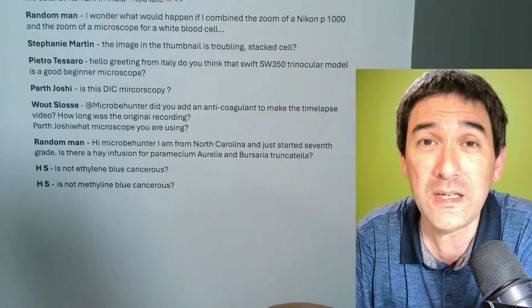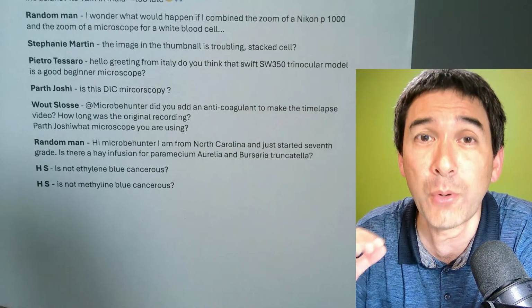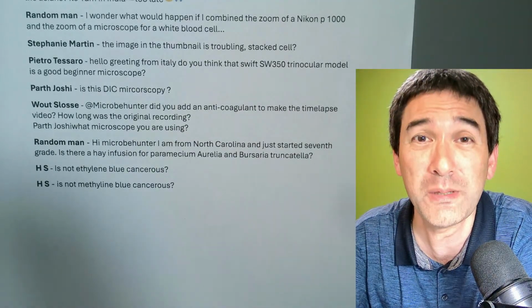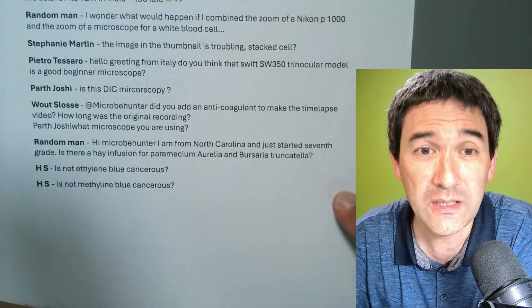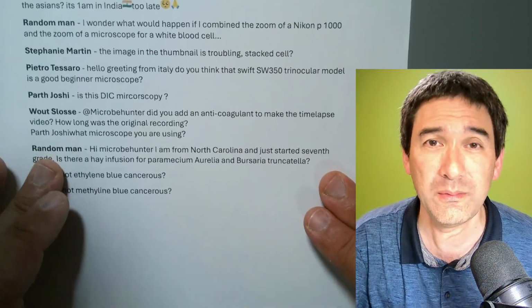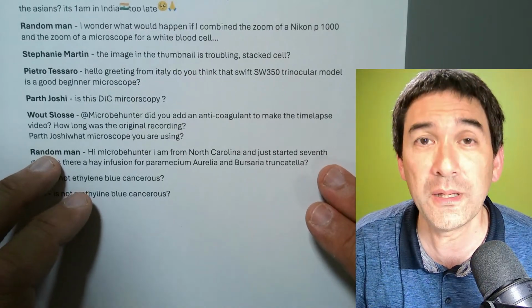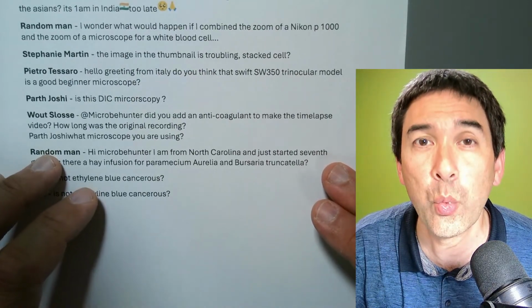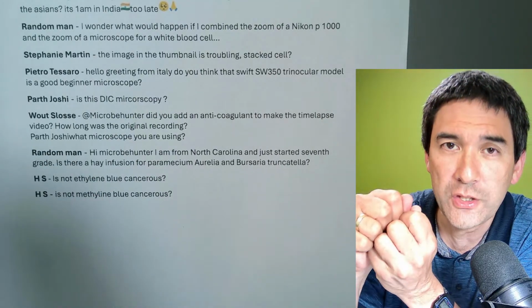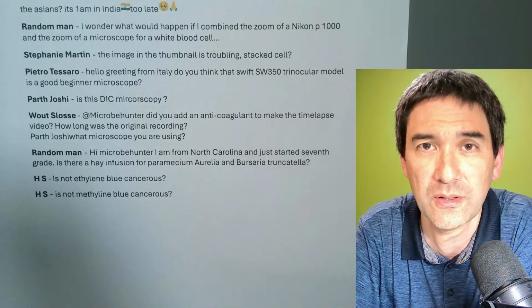So if you make a hay infusion, you have to make sure that there's really good exposure to air, and not too much. And I'm not happy about it because there are lots of bacteria in there growing as well. What I would suggest, or this has been done as well, you're still growing unknown bacteria, but you can take a pond water sample and add a crushed grain of wheat. You take 2 spoons, crush a wheat grain, and drop it into the pond water sample.